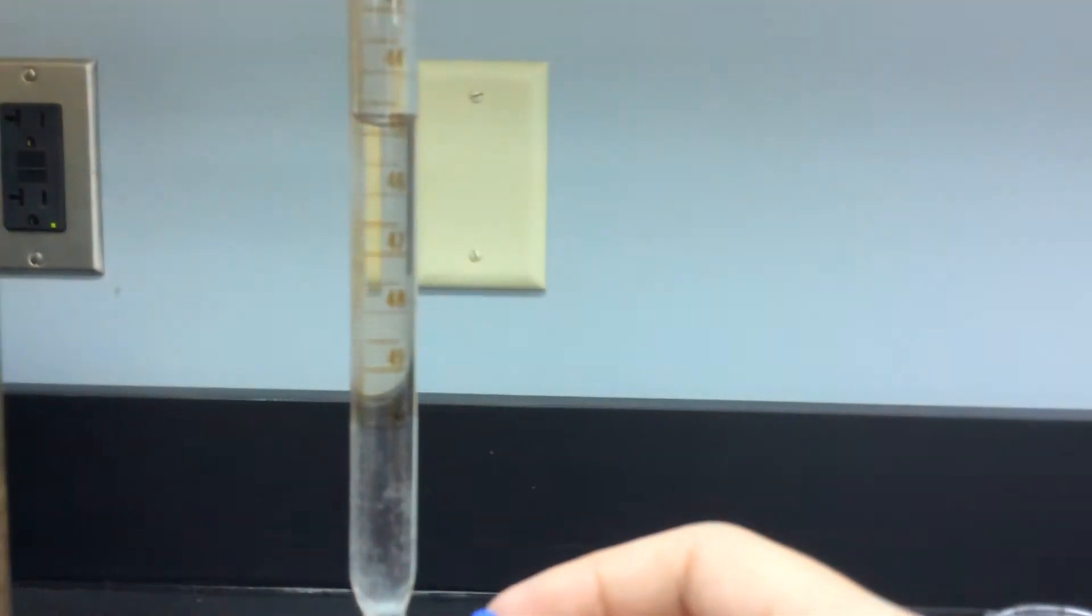Because remember, a burette goes from 50 up to zero, and it works by subtraction. So when I'm dispensing, I want to watch my level. I've got about five more milliliters to go.